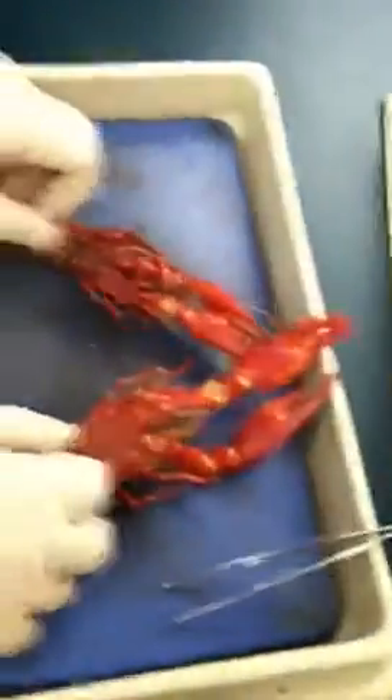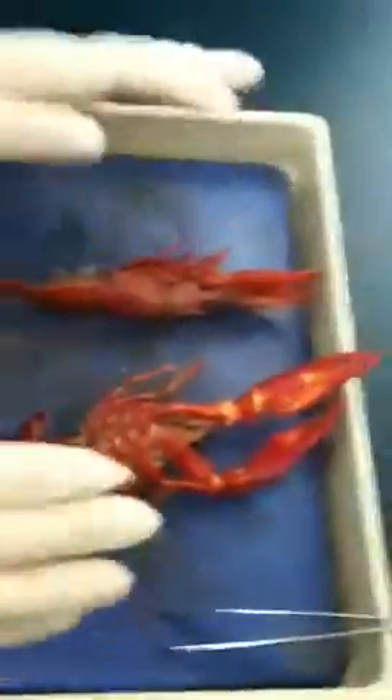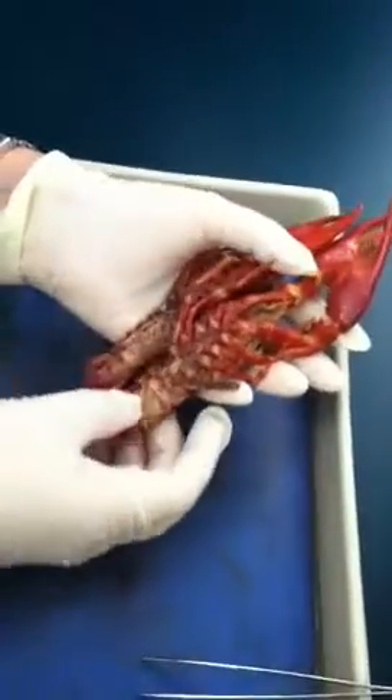Okay, so now will be the external observation of the crayfish. So it's the same for crayfish — we still need to tell the sex. It's pretty easy, it's not too bad.